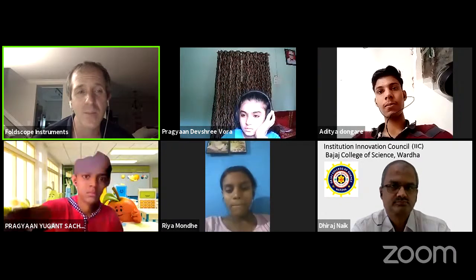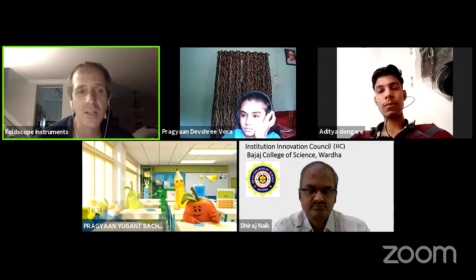So where we started, the problem was to ask ourselves the question, how can we do microscopy at high magnification for $1 in parts? And that's really where we started. When you push the problem to that extent, where you're really saying you only have a $1 budget, it really makes you think differently, right? Because what part of a conventional microscope is even $1? You can't even get the little cover for the eyepiece probably for that price.